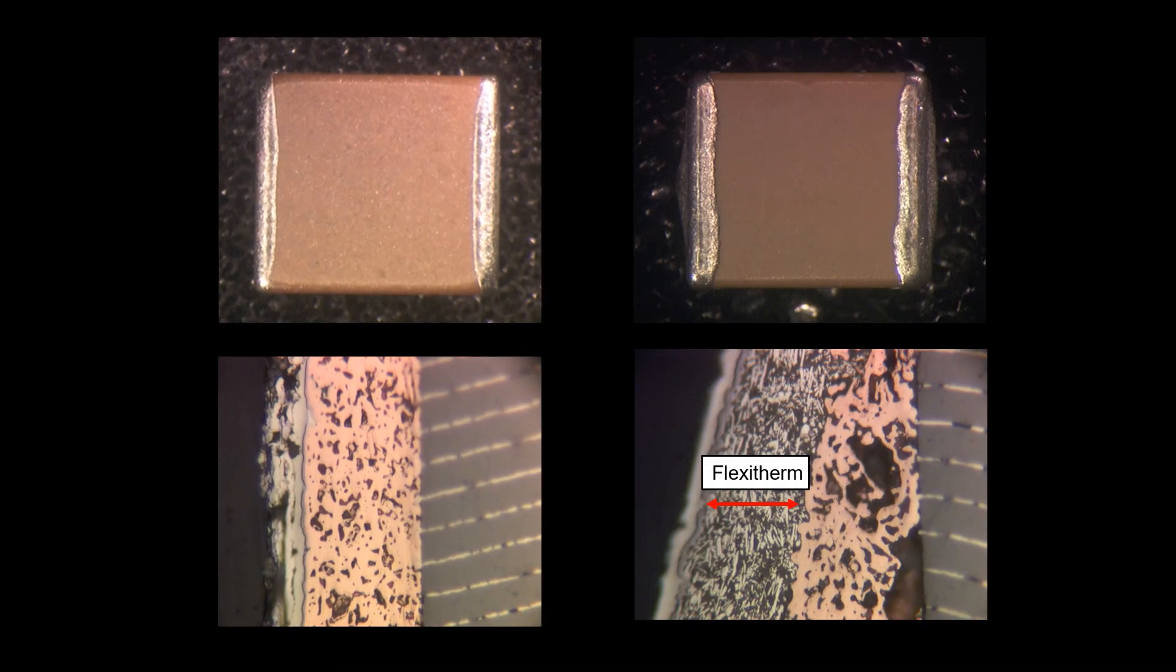These are cross sections of two MLCC capacitors. The cap on the right is a genuine flexi-therm. The cap on the left was marketed as a flexi-therm. We can see under a microscope that the one on the left is missing the flexi-therm layer.